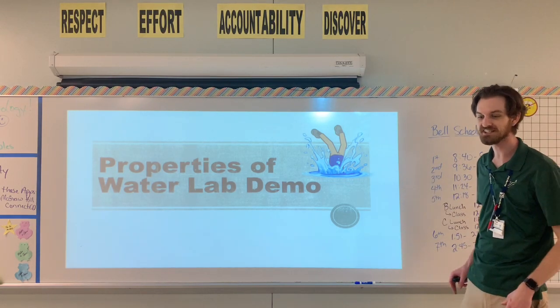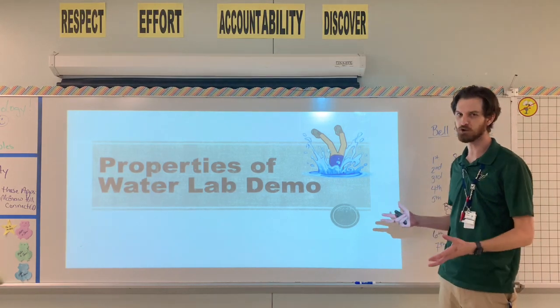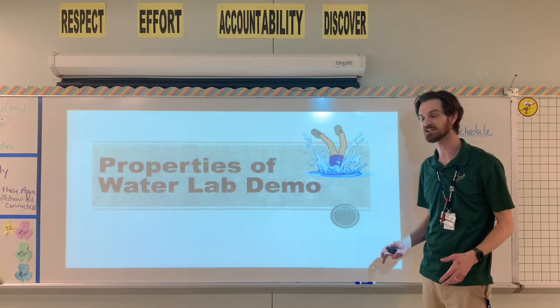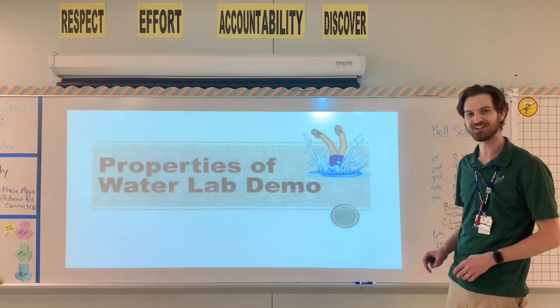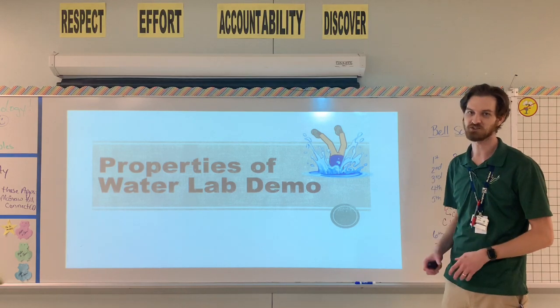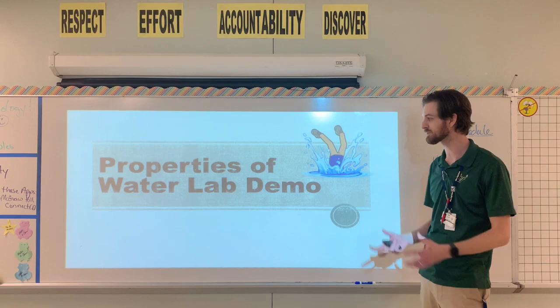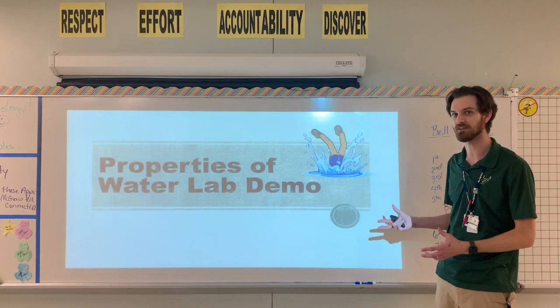Fitzgerald's biology class. Today we have something cool that's going to happen. At least I hope it's cool, depending on how well I edit this video. But we're going to investigate some different properties of water through a little bit of a demonstration. So instead of you being hands-on throughout the whole process in the classroom, we're going to do a digital version and see how well that goes.